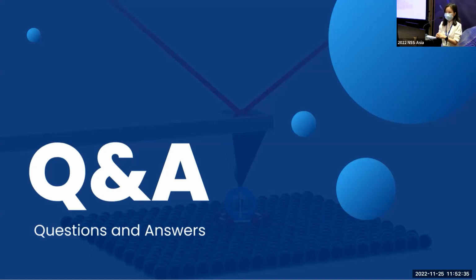What I understand in your description of the KFM is that you're measuring the difference of the work function, I understand. But what is different from the STM, scanning tunneling microscopy image scanning? Is this just a difference in the amount of the electric field that you apply? If you can apply more bias in your KFM, then is it more similar to STM?